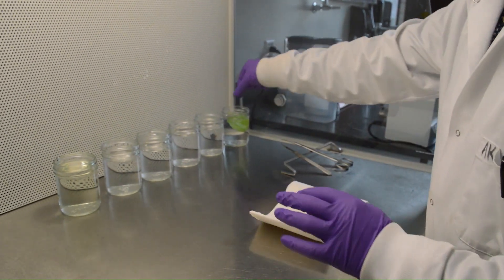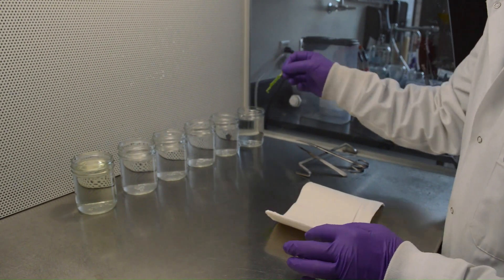After washing, blot dry the sterile leaf with sterile blotting or tissue paper.